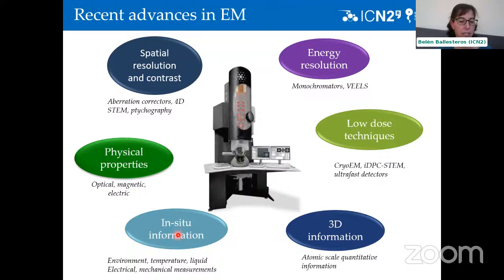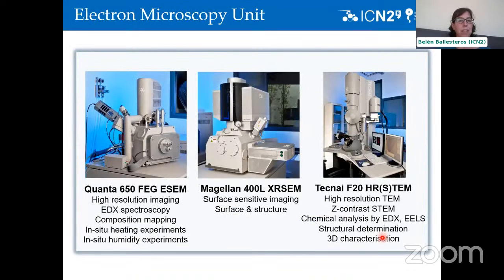And then there is the development of low dose techniques like cryo-TEM, and so on. And also there is a lot of research going on to get 3D information and to get atomic scale quantitative information in the three dimensions, let's say.